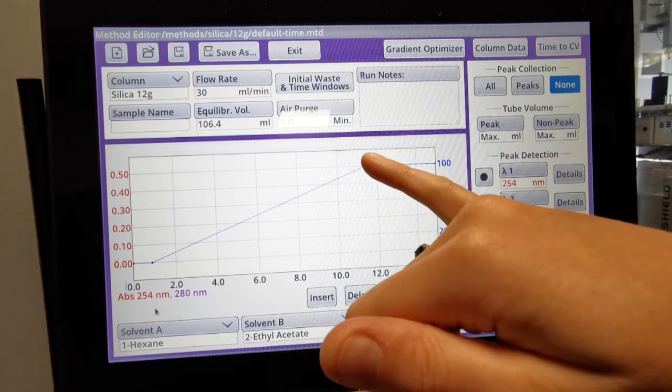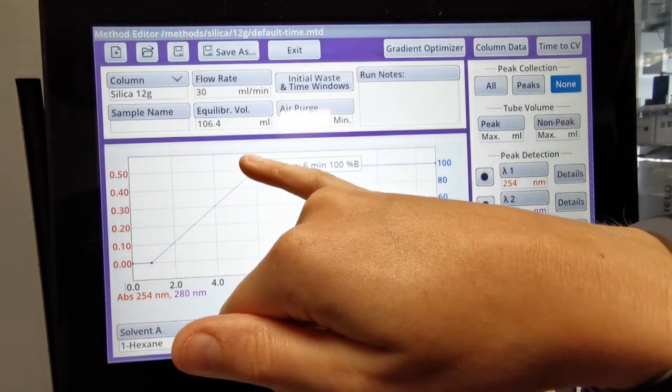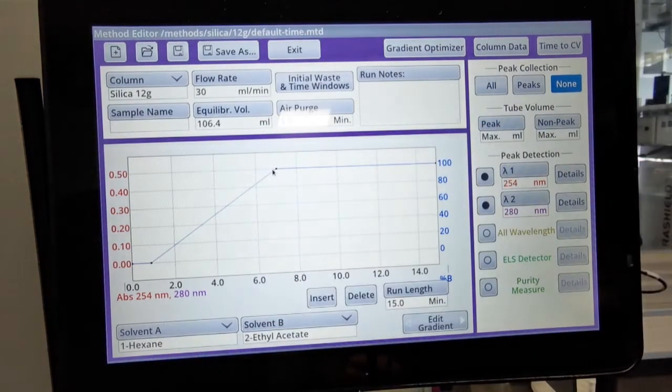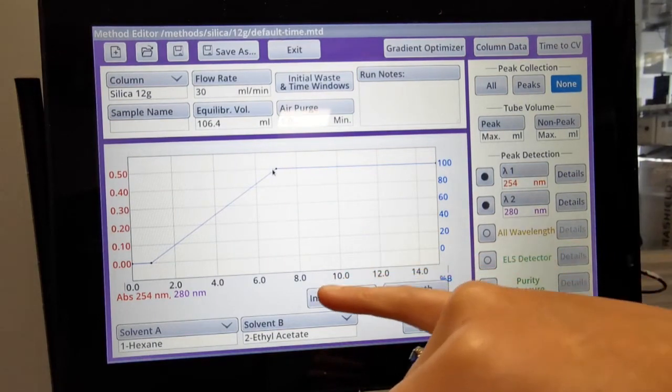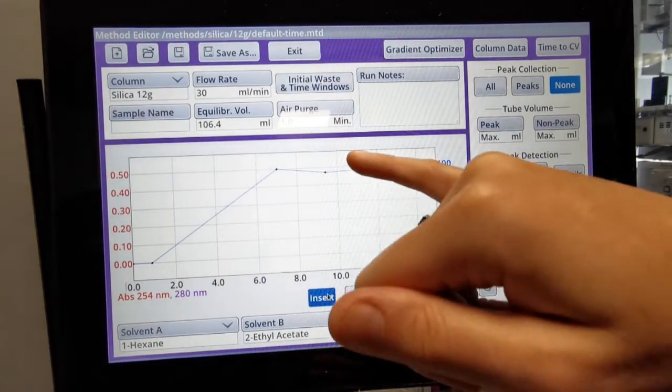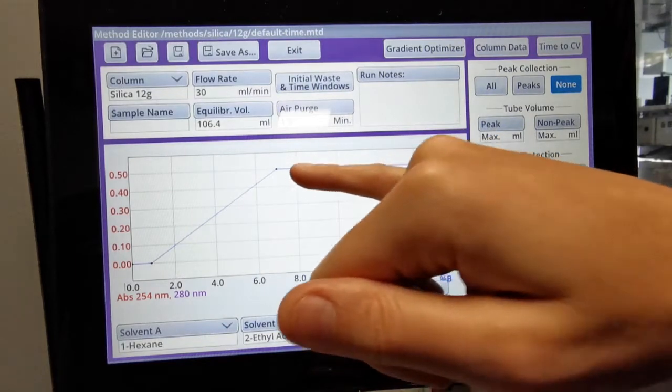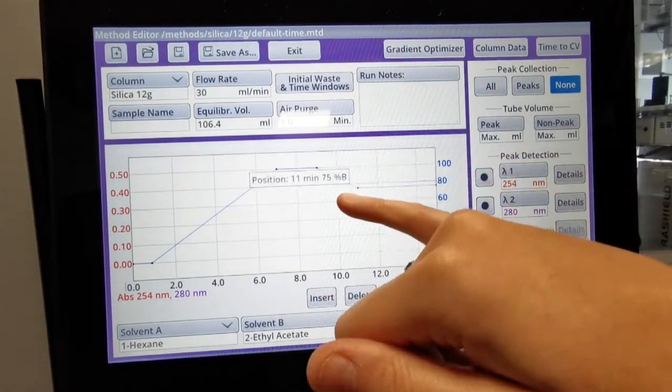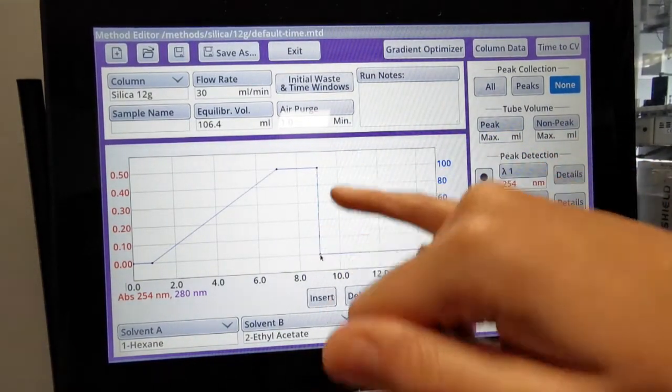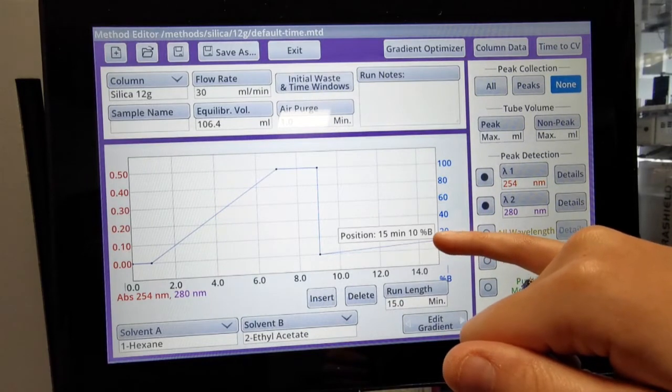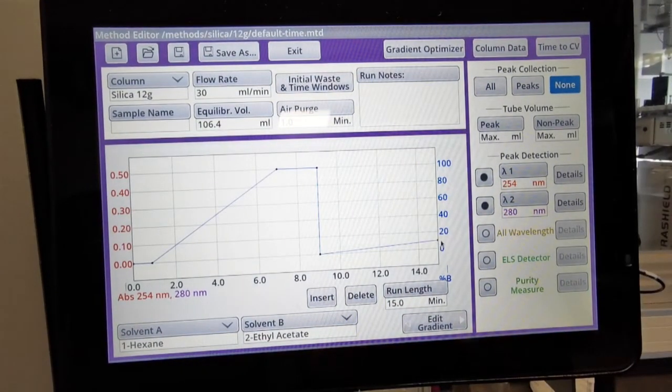have that short hexane ethyl acetate gradient to start. We then want to bring the gradient down, so I insert a couple of points. I'll keep that 100% to have the ethyl acetate wash, bring that right down, and then we'll have a 0 to 10% gradient of the DCM methanol. However, all of this is still set up in hexane ethyl acetate.